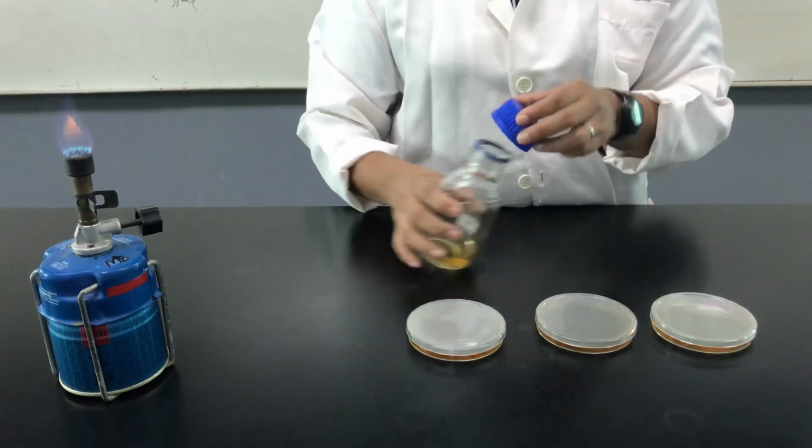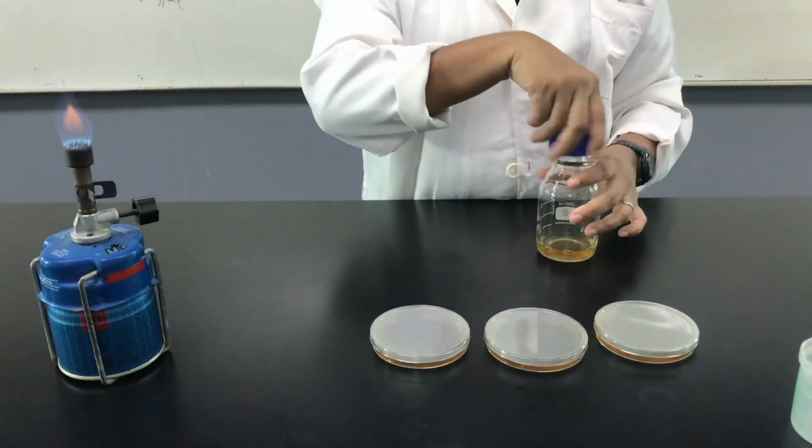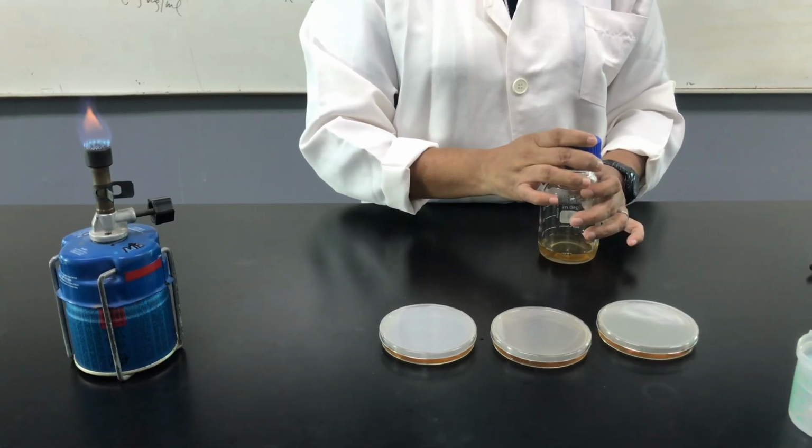Now we leave it to solidify for about 10 to 15 minutes. Then we come back again and show you how to do the standard curve and the culture Nisin.